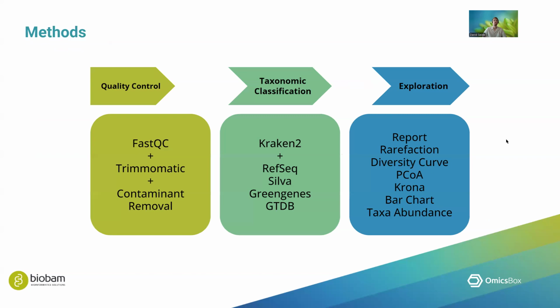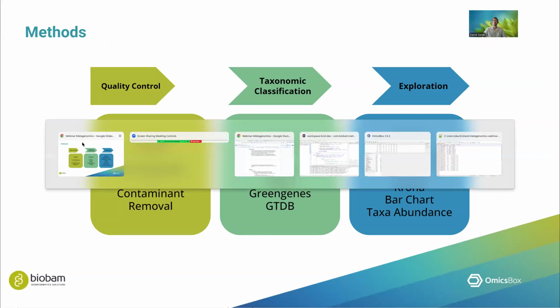And now let's look at what I have prepared today. We want to do some quality control of our short reads, do some taxonomic classification, and we want to explore the results. Let's jump right into it.